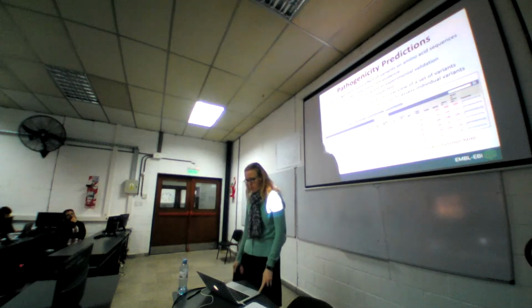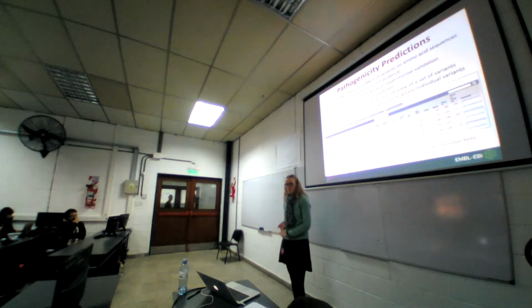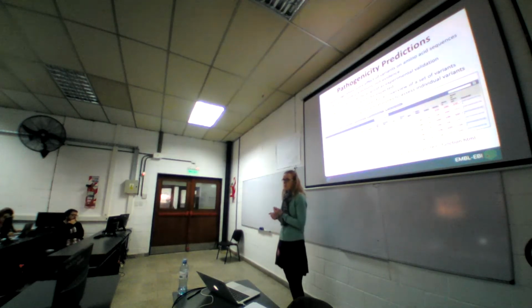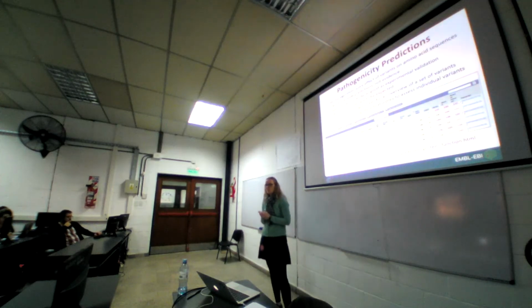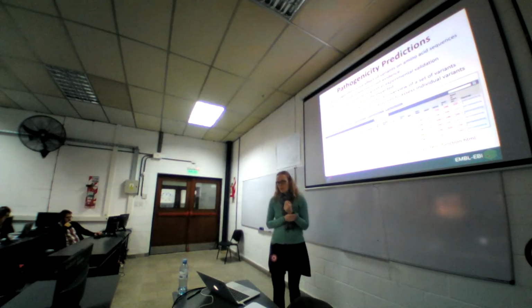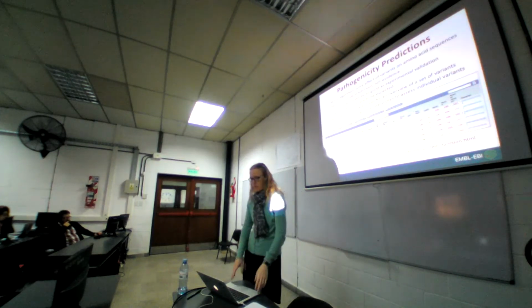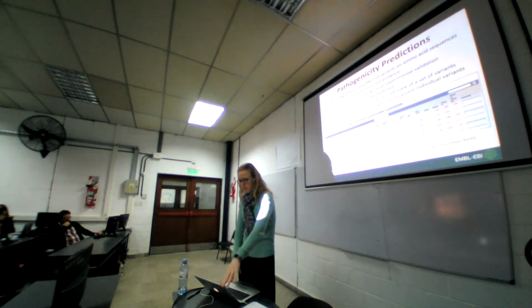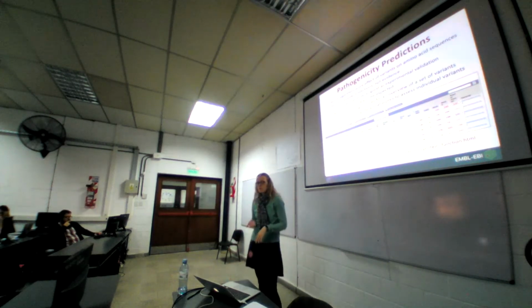We also run 6 different algorithms to predict the effects of the variants on amino acid sequences. So these are called pathogenicity predictions. We only have them for missense variants because these are the ones that change the amino acid sequences. It's important to note that all of these scores provide only predictions, not facts. And if you see anything interesting there, you need to follow it up experimentally.